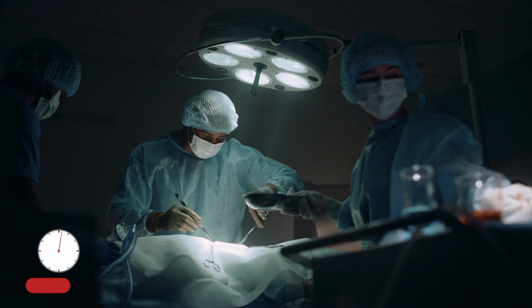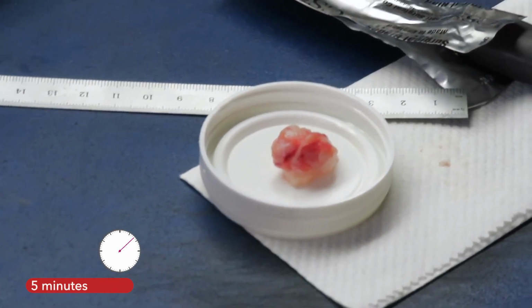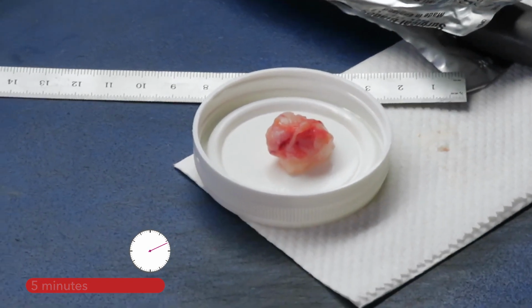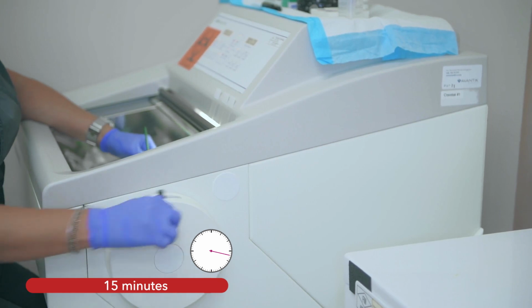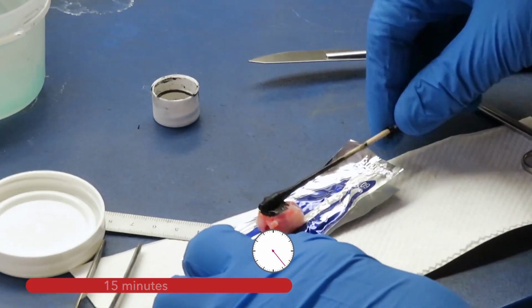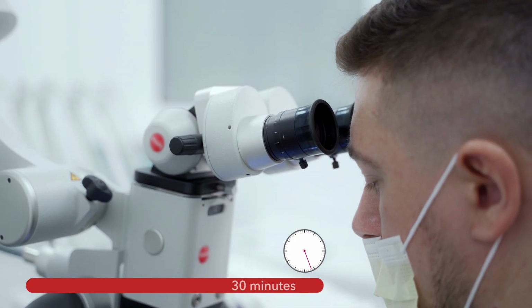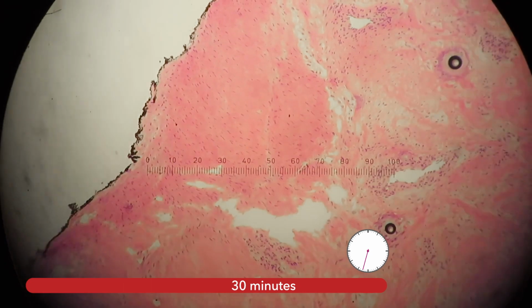The way that this is done in clinic is, during the surgery, the surgeon will remove the bulk of the tissue, and then that piece of tissue is put on a dish, and a staff person in the clinic will walk this tissue to an adjacent room. They quickly freeze the tissue, section the tissue, and then they stain with some common dyes. And a pathologist will look under a microscope and try to identify if there was still cancer or not.